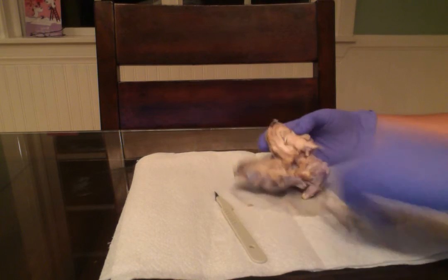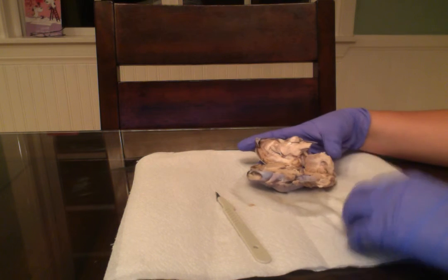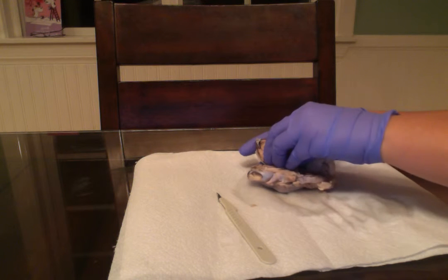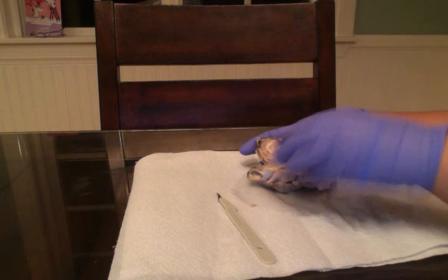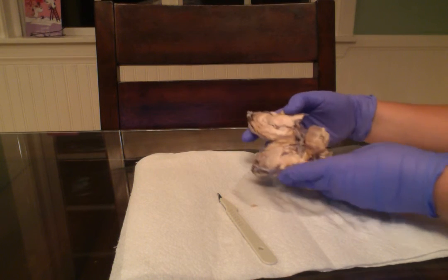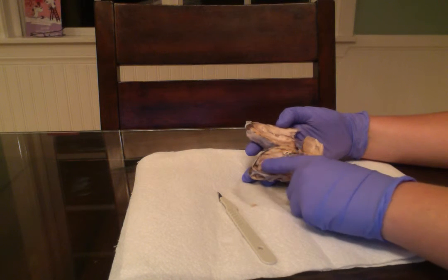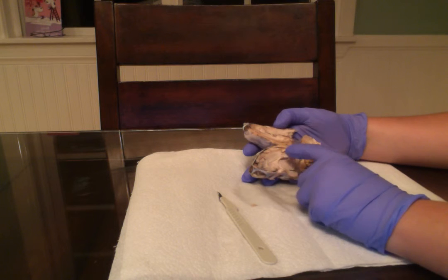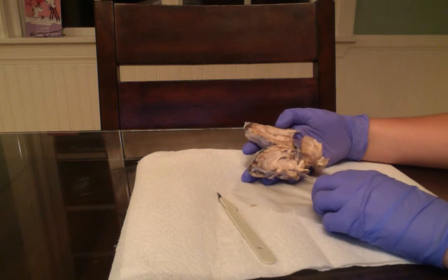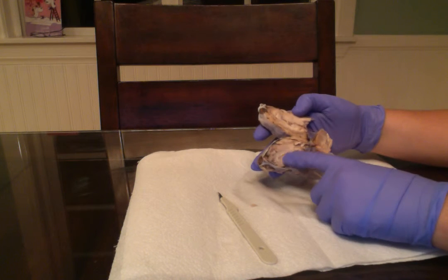All right, so this is going to show us that we need to look back once again at the cerebrum. So we have our frontal and our parietal, and then our occipital and our temporal. And then we're going to look at the corpus callosum, and that's going to be this ridge here. We then have the fornix, which will be the inward ridge here. We also have the lateral ventricle, which is going to be this guy here.